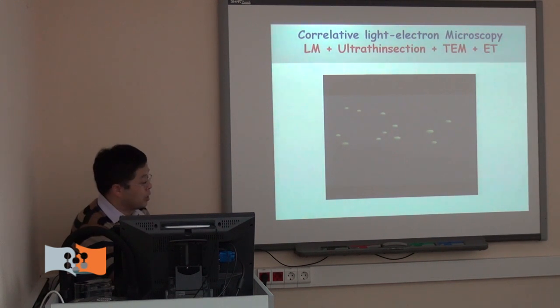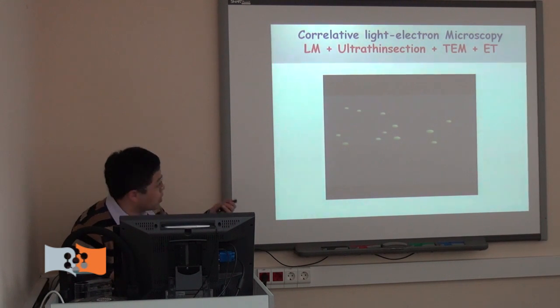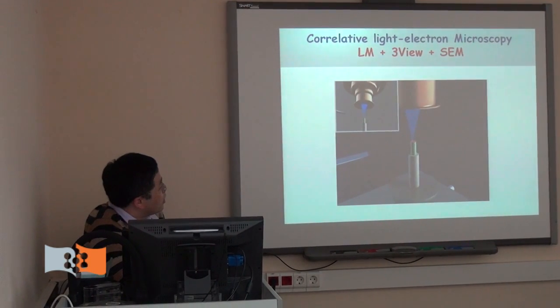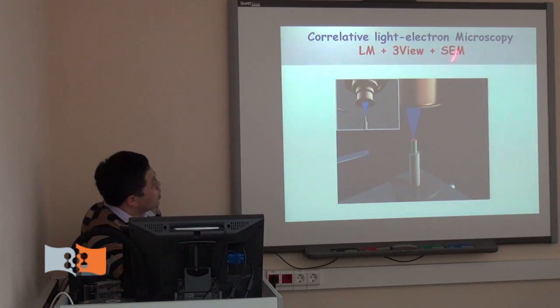This is a prototype. Then focus on this one. You can get the 3D reconstruction in the context of the cell.